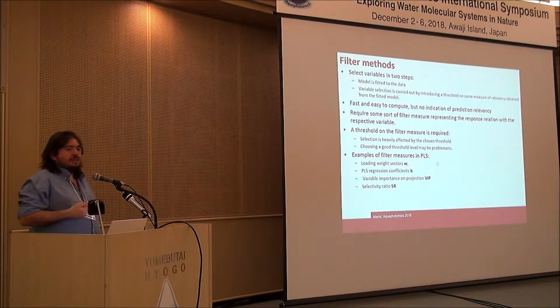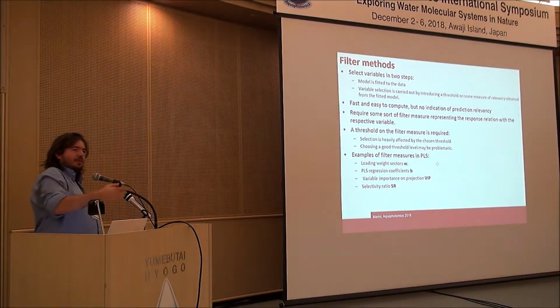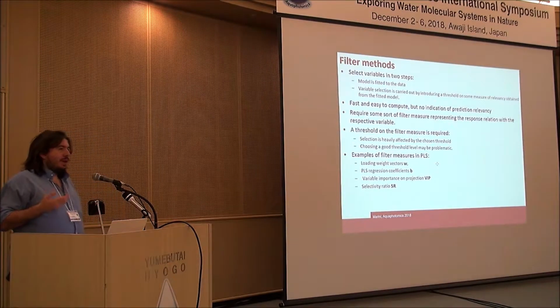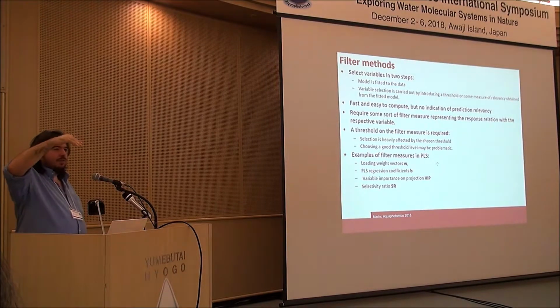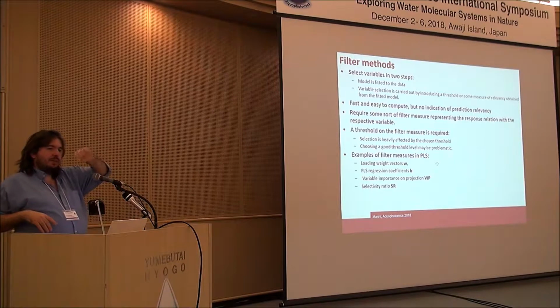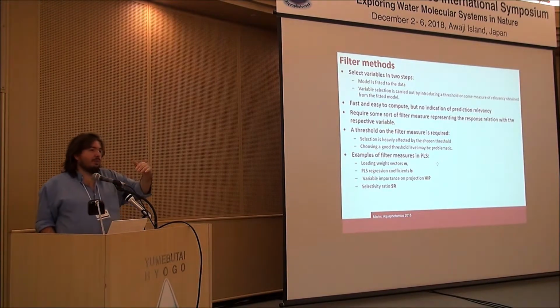The advantage is that they are fast, because you compute the model and you already have it for free. The disadvantage is that quite often you have to decide, because you will have a value of, let's say, importance index for the different variables given the model, and then you have to decide where to place a threshold.